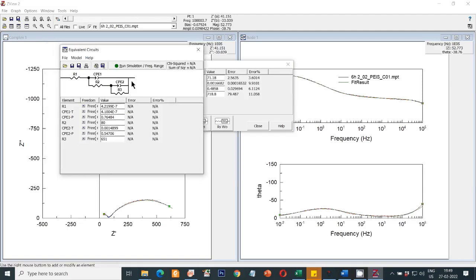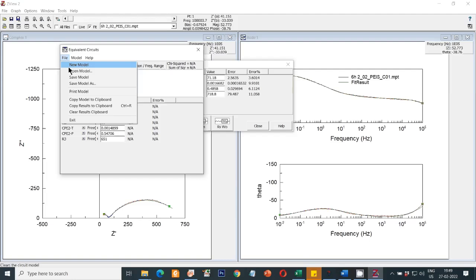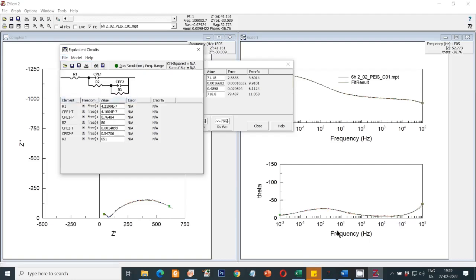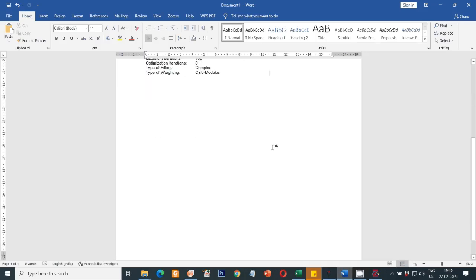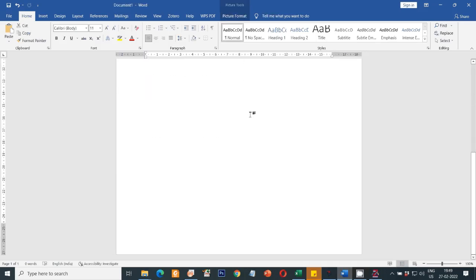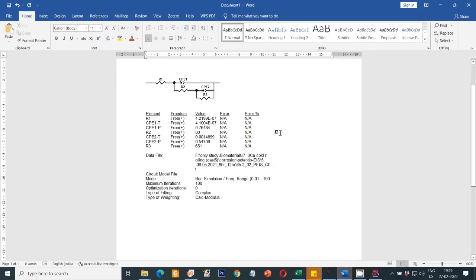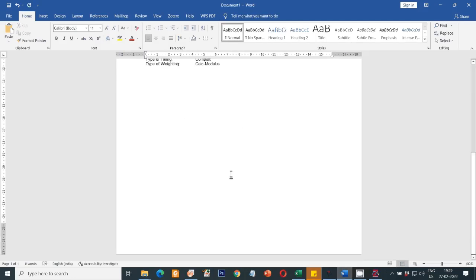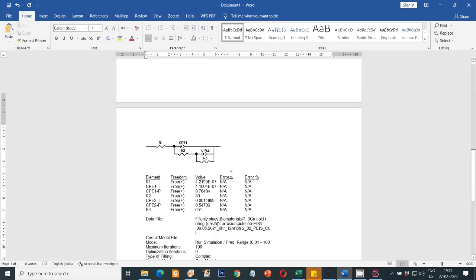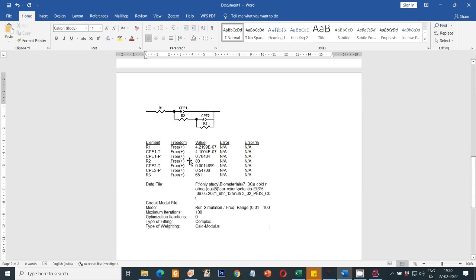In this case the fitting is perfect. To export the values, go to File and select the Copy Model to Clipboard option, then paste it. These are the fitted parameters.